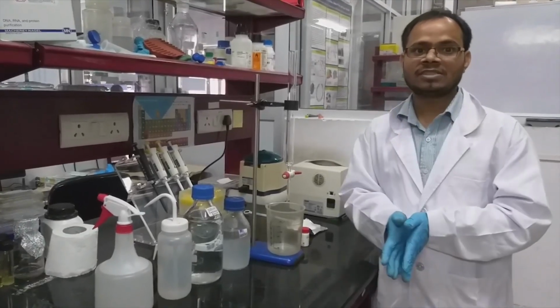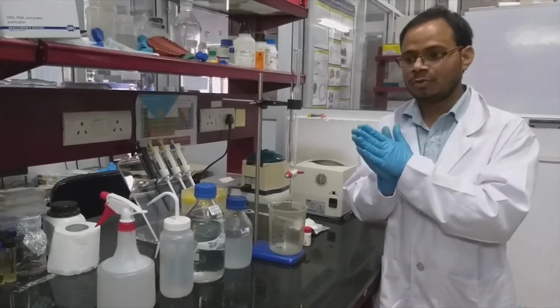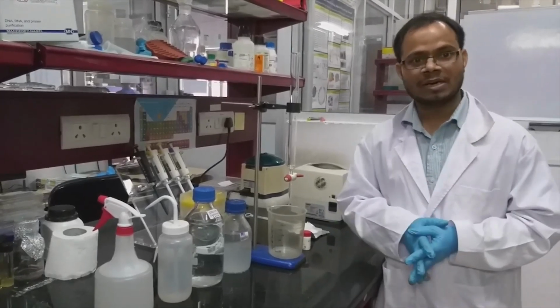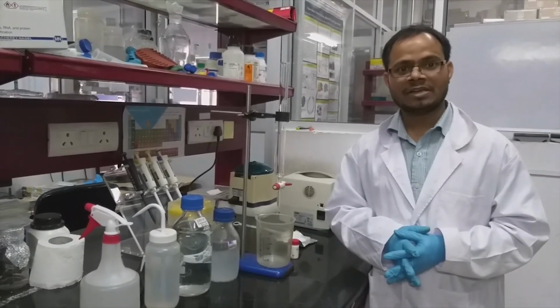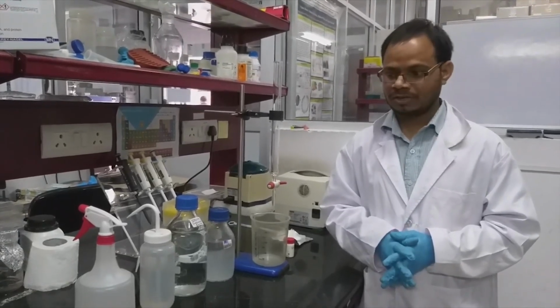So it will elute first and the smaller molecule will be retained there, and we have to give sufficient buffer to elute that one. This is the overall concept of gel filtration chromatography. It is widely used in separation of proteins, peptides, or oligonucleotides.